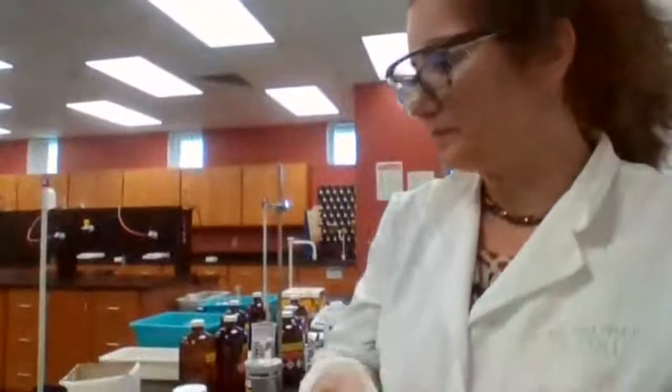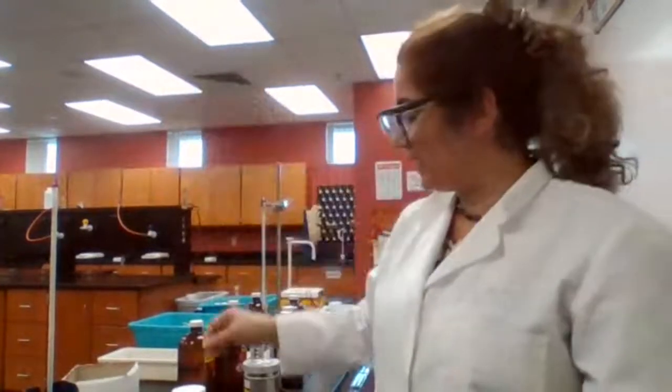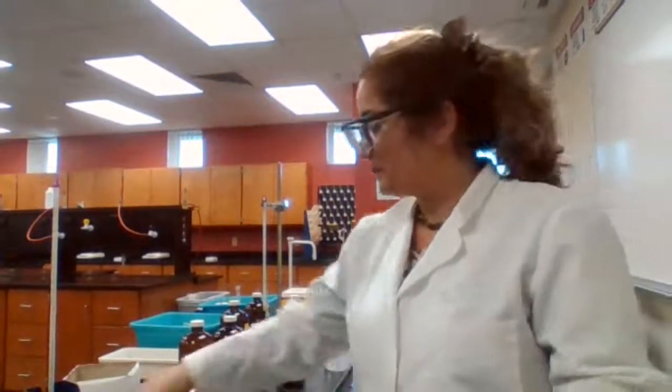Very good. Now we're going to turn off the heat. We are done with the melting experiment. We take this capillary tube out to dispose of it in the broken glass box. We are done with melting point and measuring boiling point. Last part of the experiment.